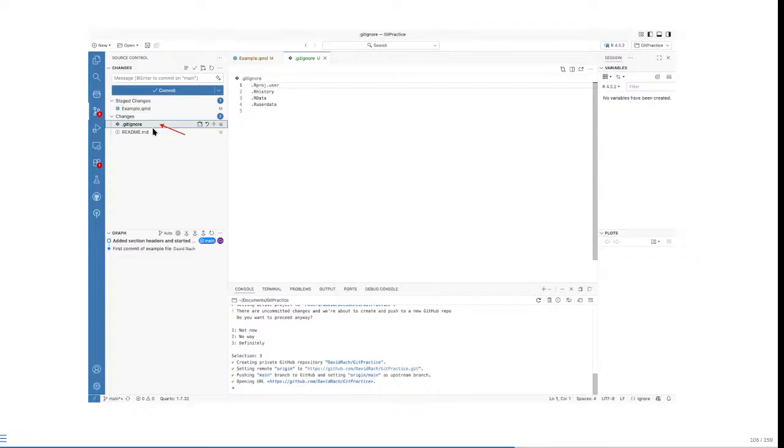There are some things occurring within our project folders we don't want version control to track. Namely, if you have passwords, you don't want your passwords shared on GitHub because worst case scenario, if GitHub ever gets hacked in the future, you don't want people to have access to those passwords. Same thing, FCS files can be quite massive, and GitHub only lets, I think it's 50 megabytes per file size go up.